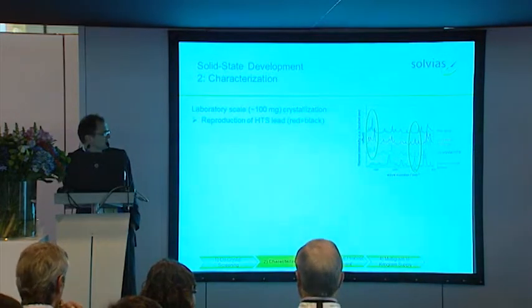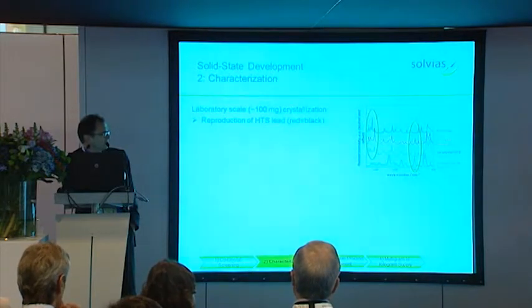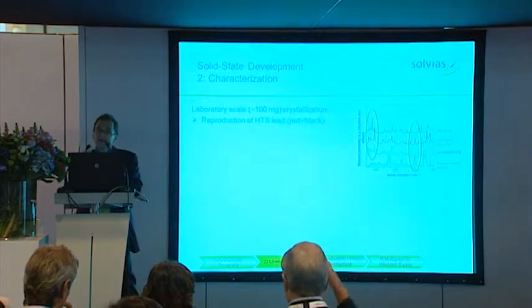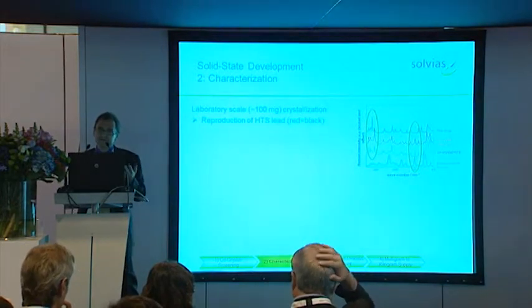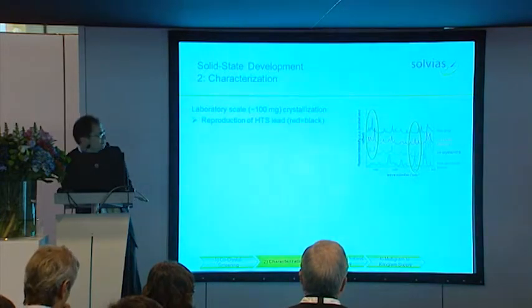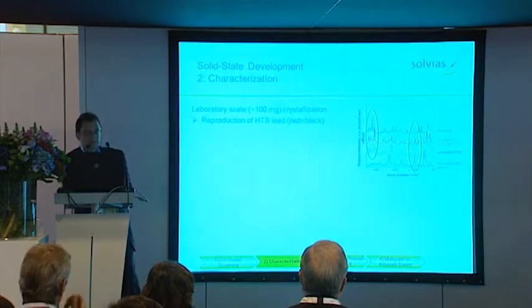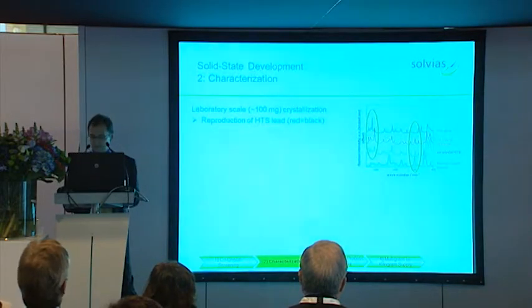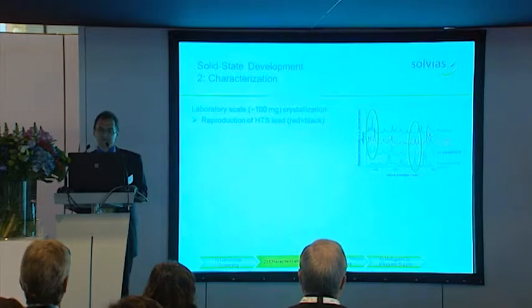This solid had lines from both the co-crystal former and the free drug, but they had shifts in the lines, so that was a good indication that co-crystal formation had taken place. The scaled up co-crystal at 100 milligram then had the same Raman spectrum as the 1 milligram co-crystal in the high throughput screen, telling us we had made the same.